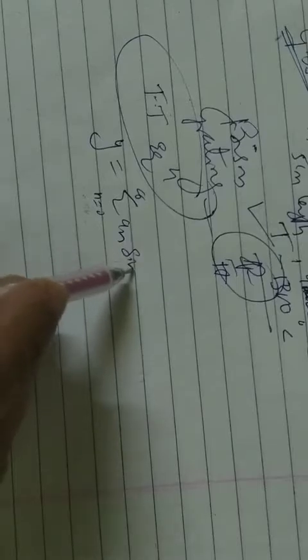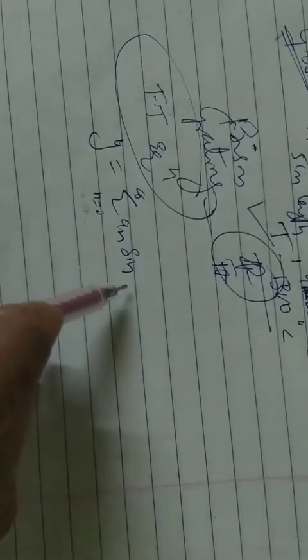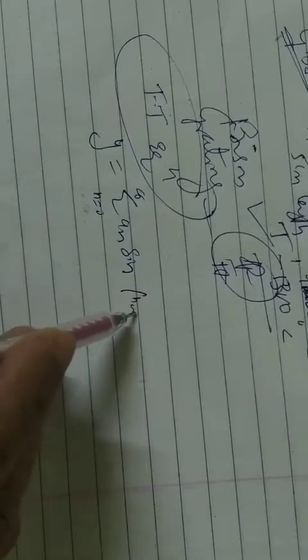Okay, and the Fourier transform equation is a computerized equation. It is given by the formula y equals the summation from n equal to 0 to infinity of a n sine n omega x plus b n cos n omega x. I have taken a very short route to the final mathematical derivation of how the Fourier transform equation is formalized in the computerized system, the summation of both a n sine n omega x and b n cos n omega x.